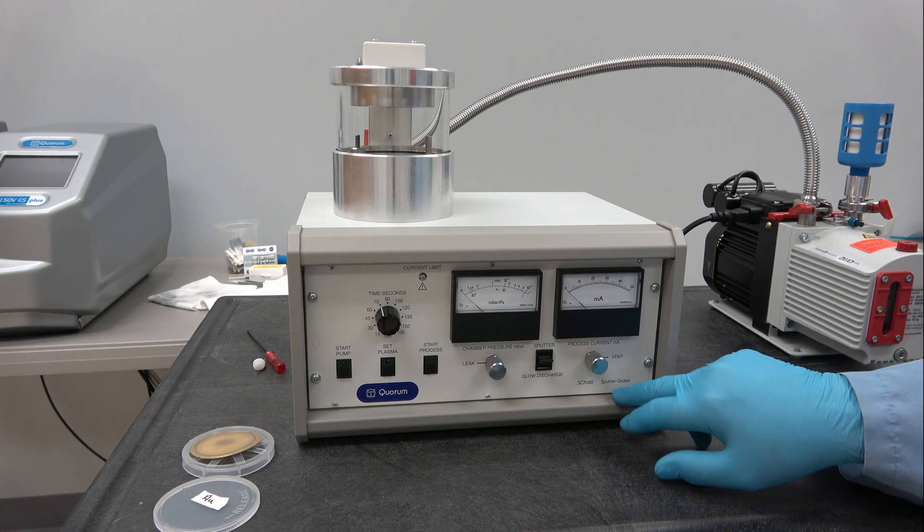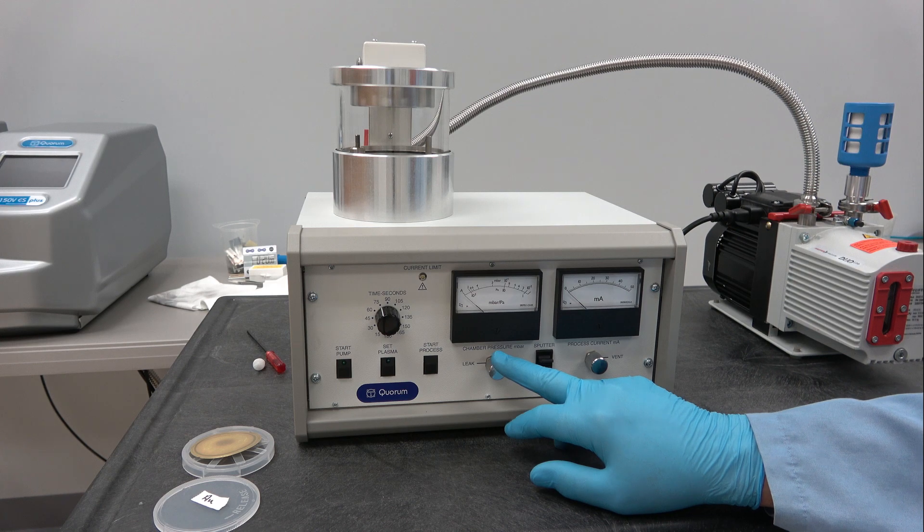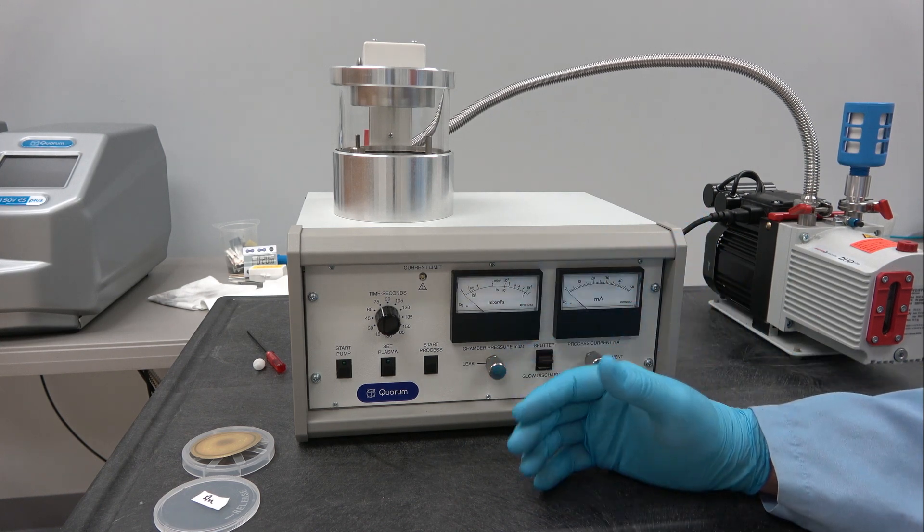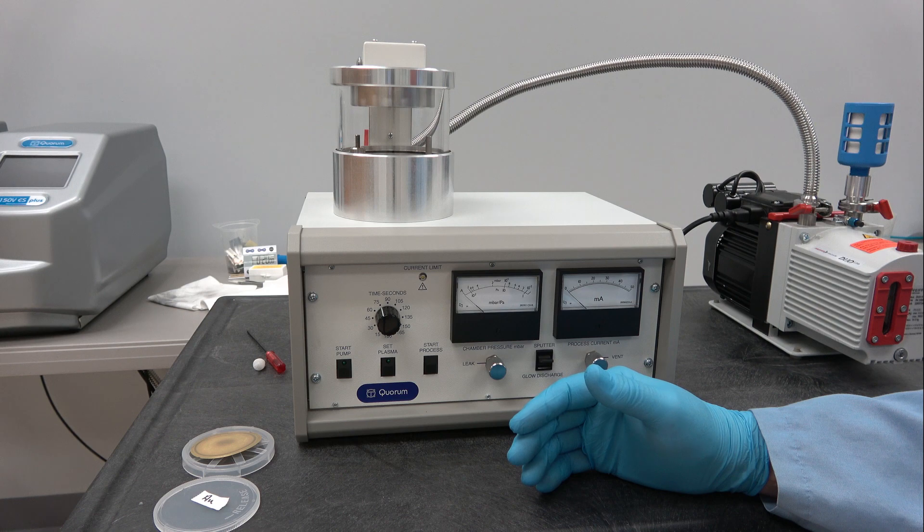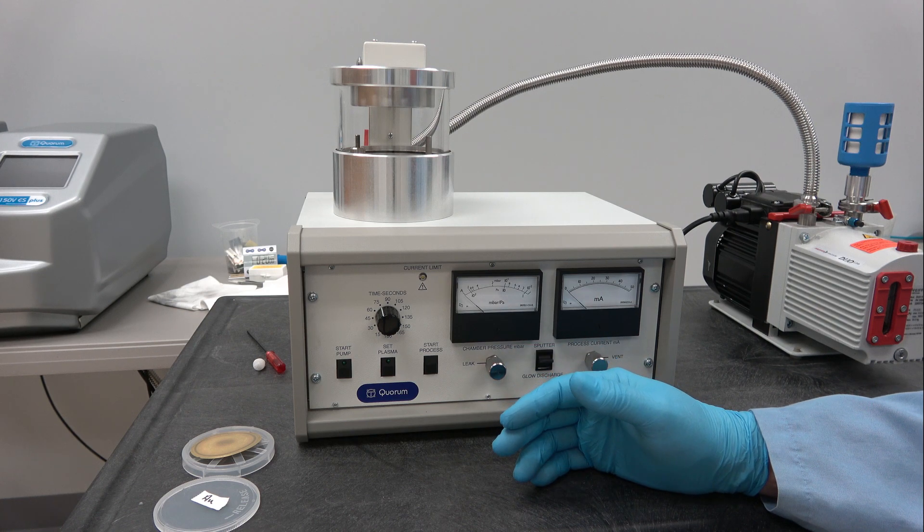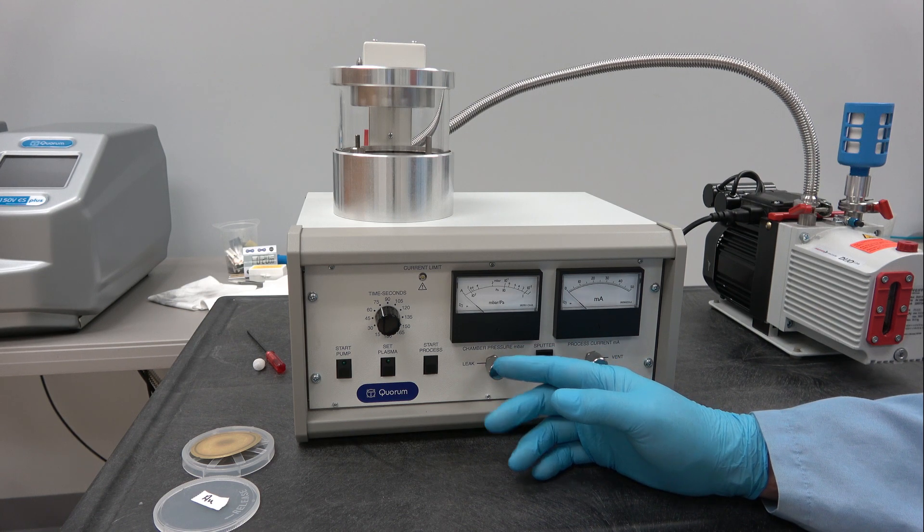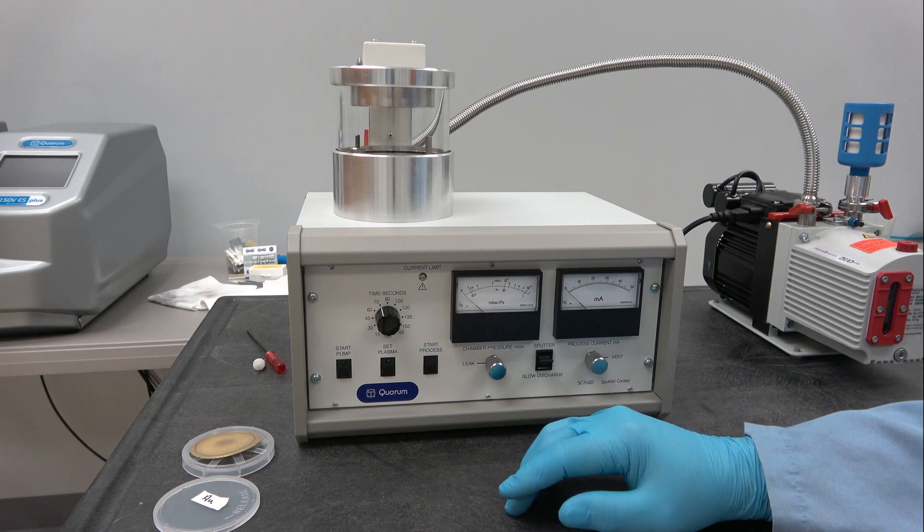Here we have the vent valve and the leak valve. The vent valve is when you want to vent the system at the end of the process after the rotary pump is turned off. The leak valve allows you to set the sputter current.